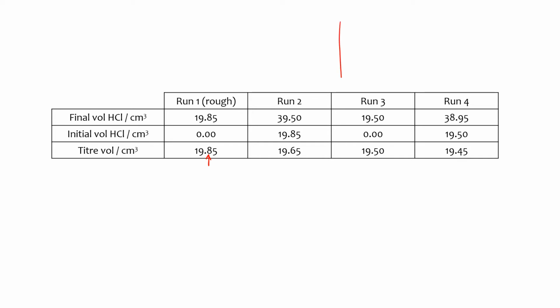And you'll either be looking at your meniscus measuring, if we were to do a very much a zoom in, the meniscus will either be on the line or it will be between 2 lines. Now, if it's on the line, we would say that that is 0.00. And if it's between the lines, we would say that that is 0.05. So you can't be any more accurate than either being between or on the line. If it was ever so close to the line, although it's not on the line, we'd read that to be on the line.